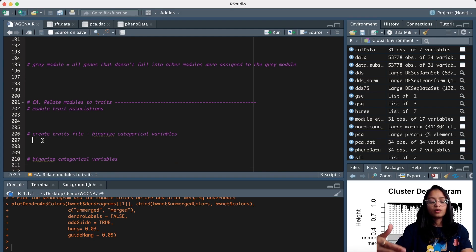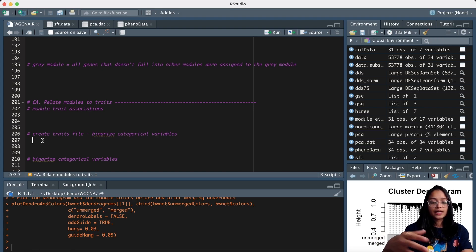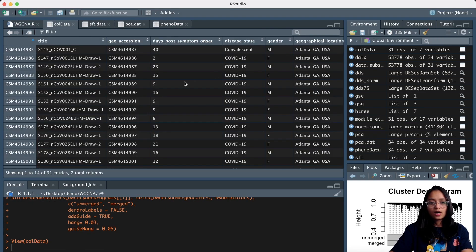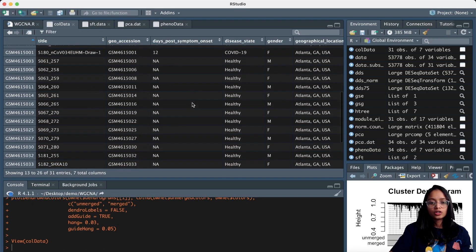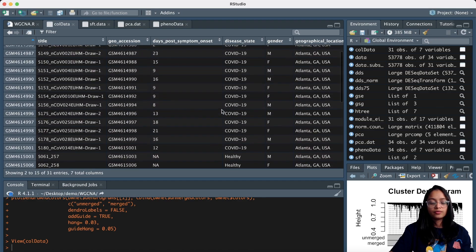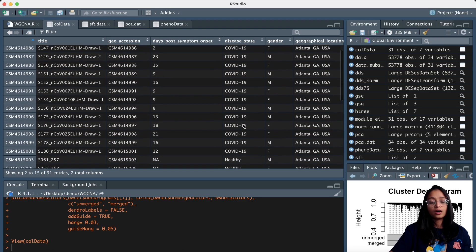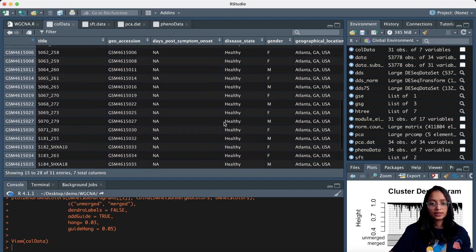Recall at the beginning of the analysis, one of our biological questions was to find genes or clusters of genes — that is, modules — that have significant association with patients having COVID-19. If you look at the call data, that is our phenotypic data, you will see that we have that information in a column showing which samples or patients are COVID-19 infected and which are healthy.